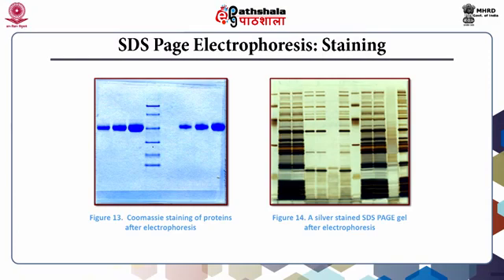Coming to silver staining, another method for staining the electrophoresis gel is the silver staining method. Silver staining is used when the protein sample loaded into the gel has a low concentration and higher sensitivity is required. This method of staining uses simple and cheap reagents and equipment. The various steps involved in silver staining of an SDS-PAGE gel containing protein are fixation, sensitization, silver impregnation and development. However, silver staining requires a lot of carefully handled steps. A silver stained SDS-PAGE gel is shown in figure 14.